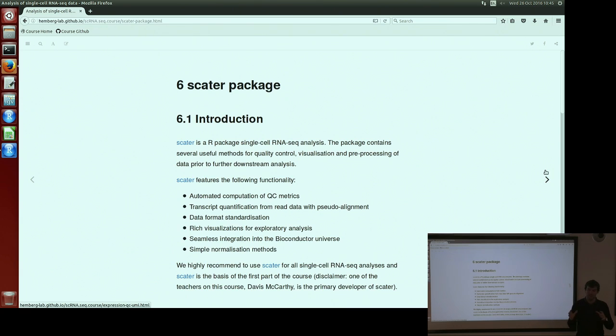So a lot of the tools that have been developed previously for expression analysis, and continue to be developed specifically for single-cell RNA-seq analysis, are in R, in Bioconductor. So doing our QC and pre-processing of data in R is quite nice, because then we have our data ready to apply the clustering, differential expression, and other tools that are available out there.